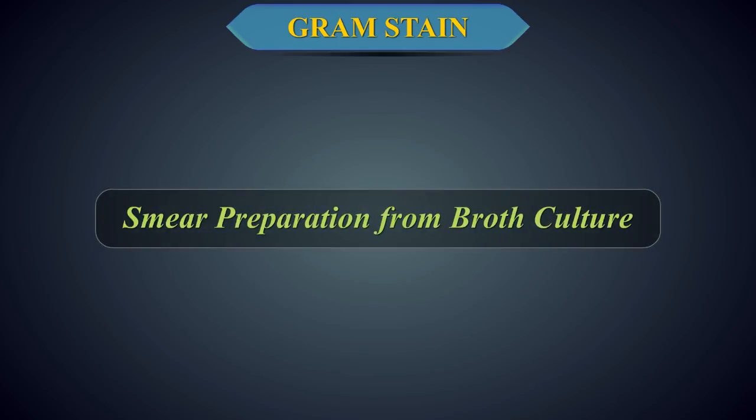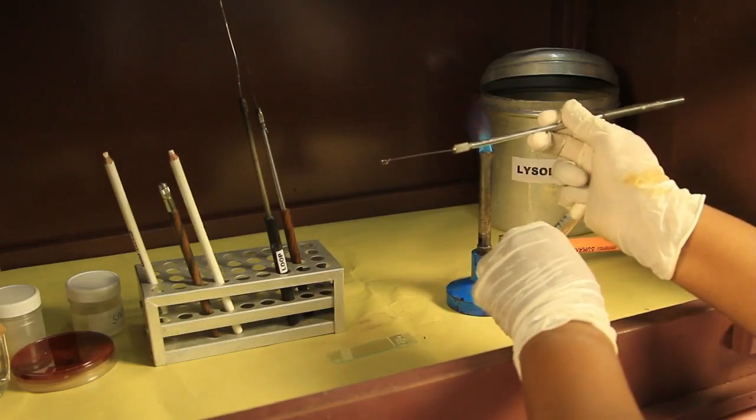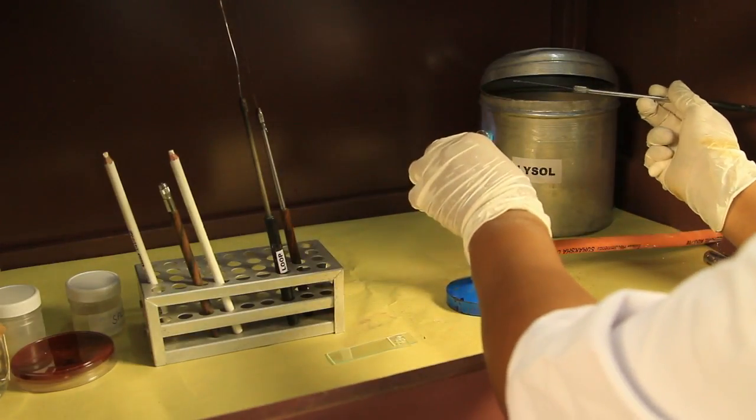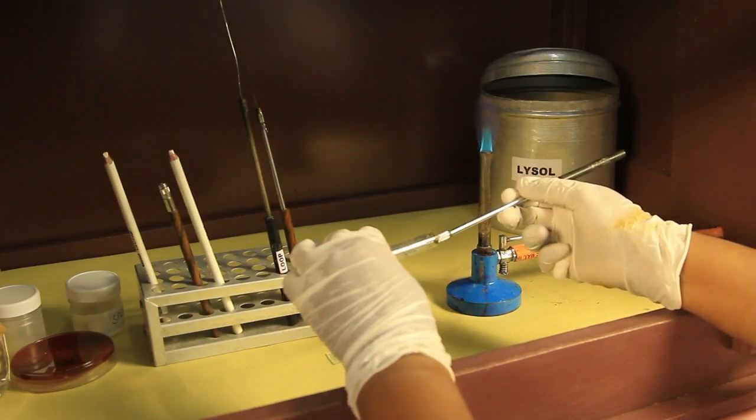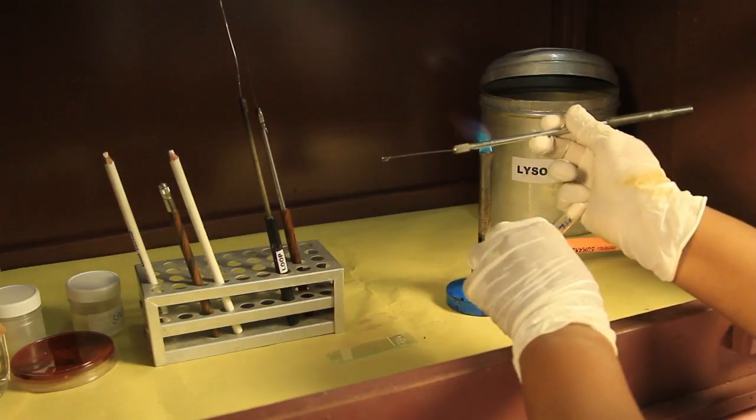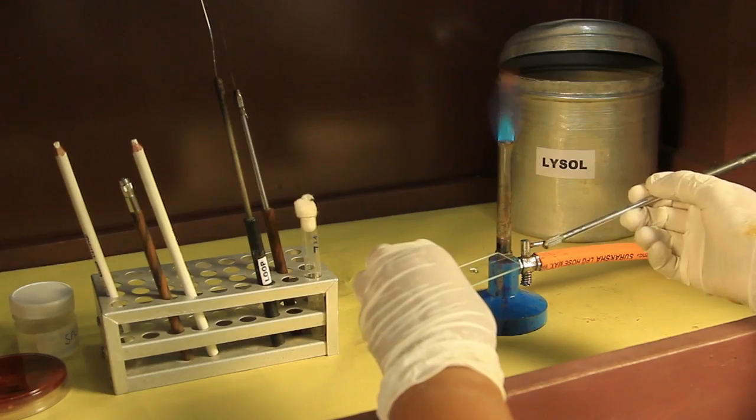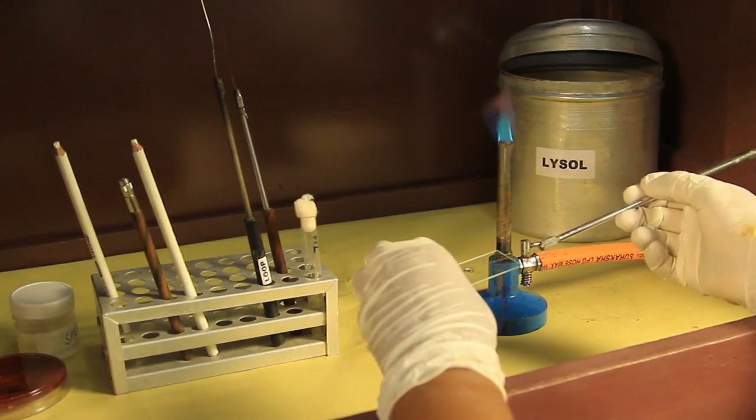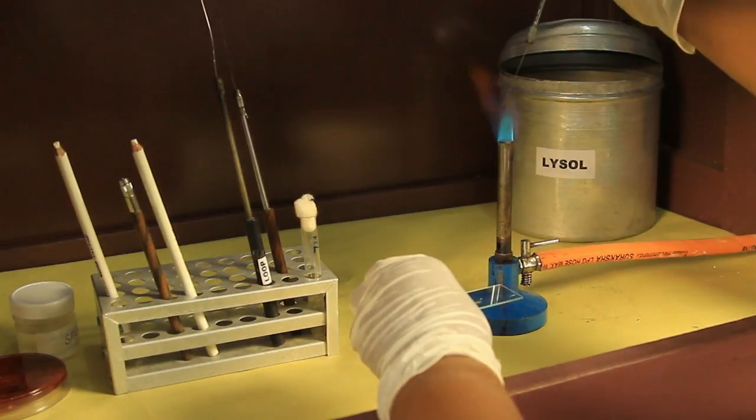Smear Preparation from Broth Culture. Take a tube of broth culture and remove its cotton plug. Flame the mouth of the tube and pick a loopful of broth culture with a sterile inoculating loop. Replace the cotton plug and put the tube aside. Spread the loopful of the culture onto the middle of a labeled slide and let it air dry. Sterilize the inoculating loop.